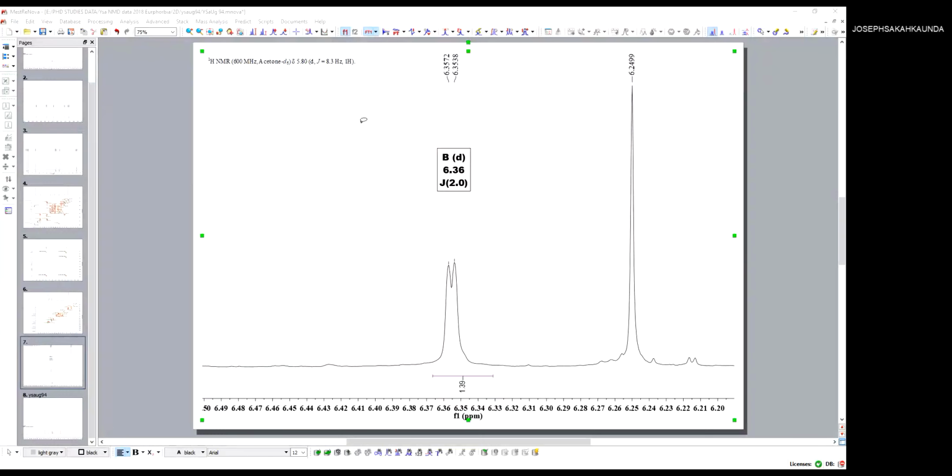And then after drawing the sugar, check your HMBC and find out if there are any correlations between some of the hydroxy groups of the sugar and any other thing within that compound. Then from there, you can start progressing from one stage to the other. In the case of this particular compound, if you start from sugar units, it will help you. You will have to get somewhere.